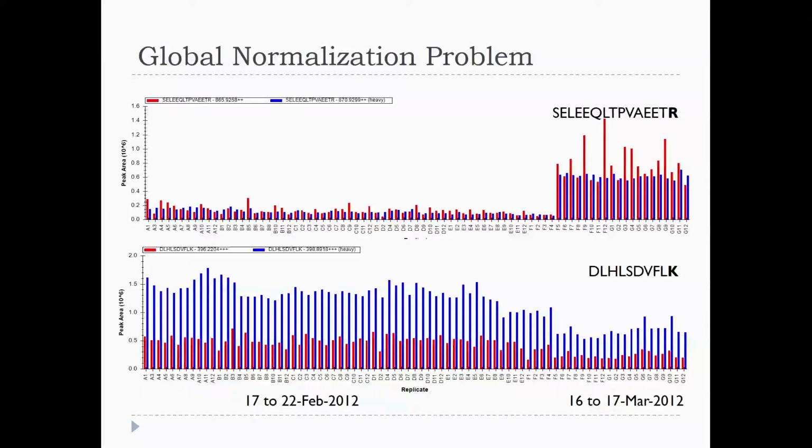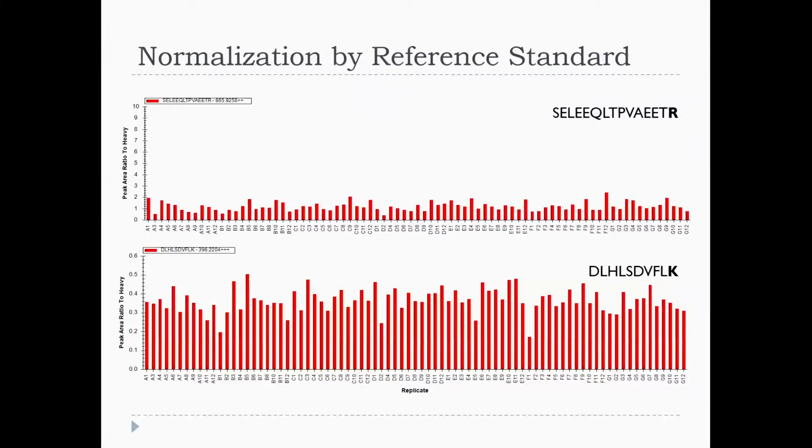But of course we do, right? Statistically, it's still 5 to 10%. We're going the wrong direction, we normalize incorrectly, but overall we're winning. And since we had injected reference standards, when I take ratios and normalize, then wow, again just like iRT normalization, it goes away. Looks totally constant.